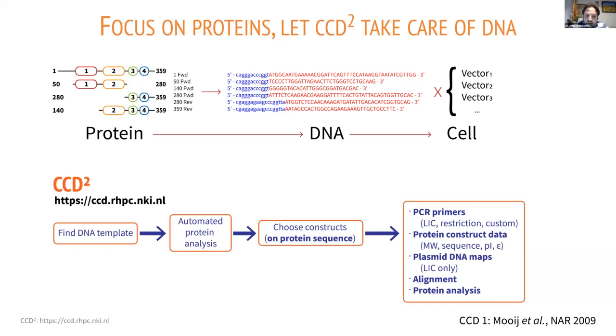I have to say that it's called CCD2 because it's the version 2 of the CCD that was designed a long time ago. But this tool was obsoleted by browser technology. And so me, for the back end of the server, and George Damascus for the front end that works in your browser, have decided to rewrite it and also add quite a few new features. I will now go through the first part, which is how we show you the information that we think you need for protein construct design.